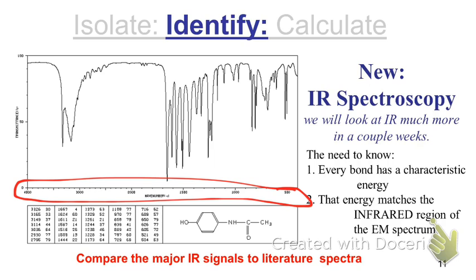When we're dealing with IR, we're looking at percent transmittance. So our peaks are actually what most people would consider valleys, okay? So all of these little jagged things aiming downwards are our peaks. Okay? Each of those represents some kind of bond found within the structure. Okay? Well, what's different between each of your compounds? Bonds.